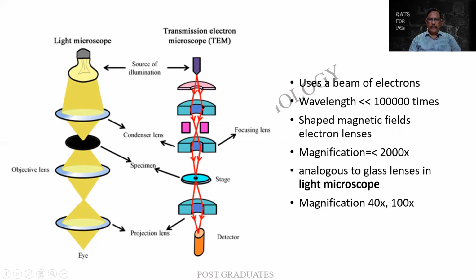It is not the objective lens that we are seeing in a light microscope, but these condensers, which are of extreme importance, and they help in the focusing of the beam of electrons onto the stage, which gets projected onto a detector, and that is being recorded. So this one you people should be having. Even now, if it is difficult, you need not bother about it. So the magnetic fields that are helping us to focus the electron lenses. Please remember this.